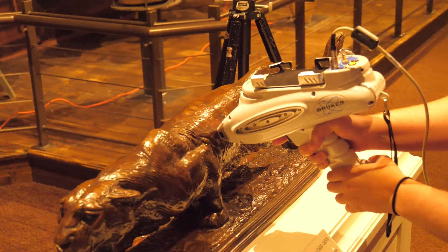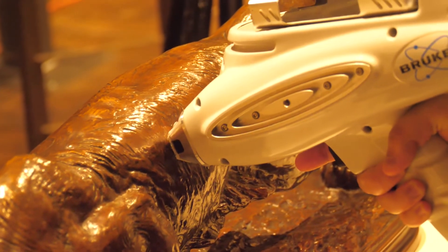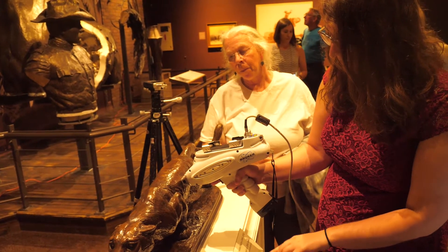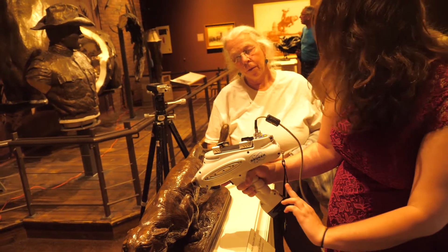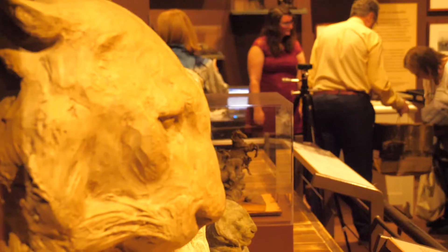As I understand it, it's also reading whatever elements are in the patina, because it's just barely going through the surface of the patina to read the metal? That's correct. So for the official study, we read the underside of the base, which is usually not patinated.